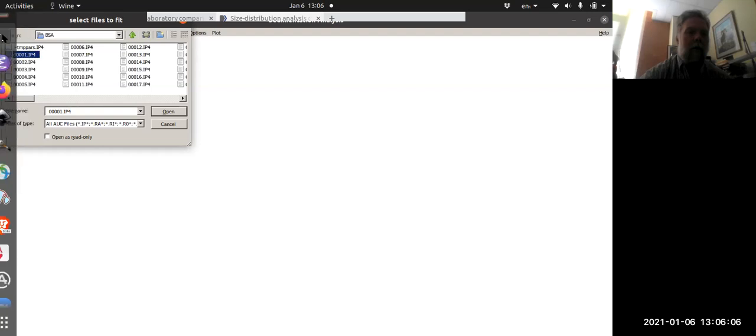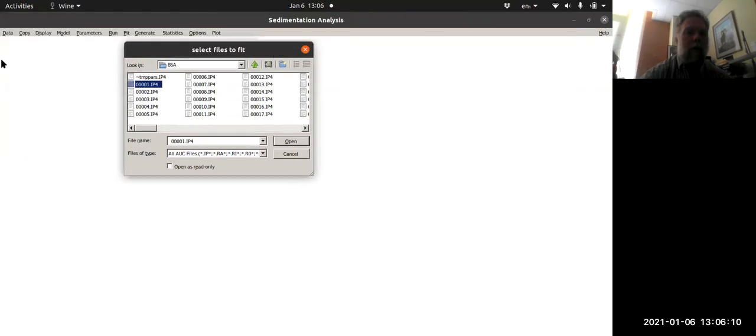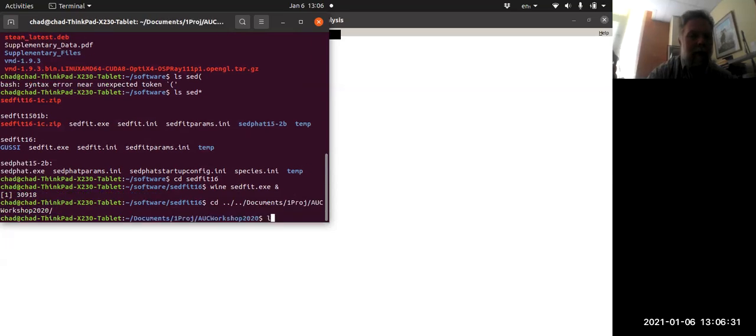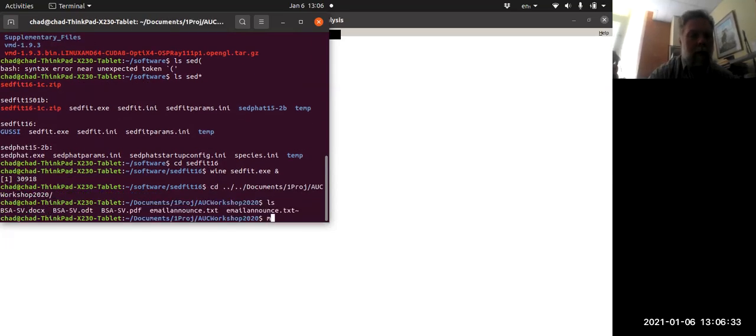Oh my God. If we go to, we can actually look at what this data looks like, I believe. It's not there.